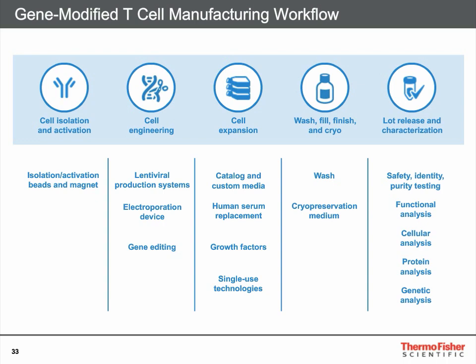And so throughout the workflow, whether it's in cell isolation and activation, engineering, growing up those cells prior to reintroduction, or cleaning them up and purifying, or ultimately characterizing them with a final QC, all of these things involve cell-based assays such as flow cytometry. And so cytometry is a critical component in this field.